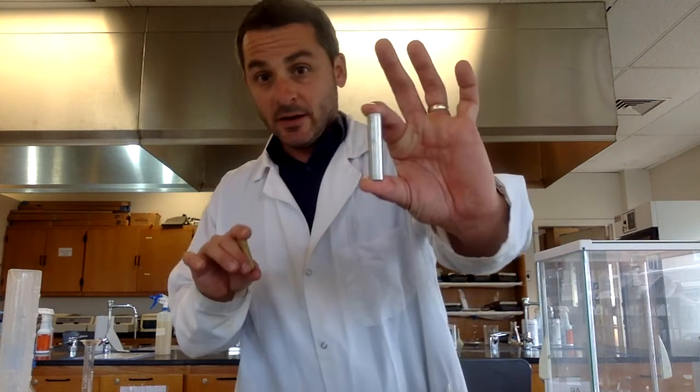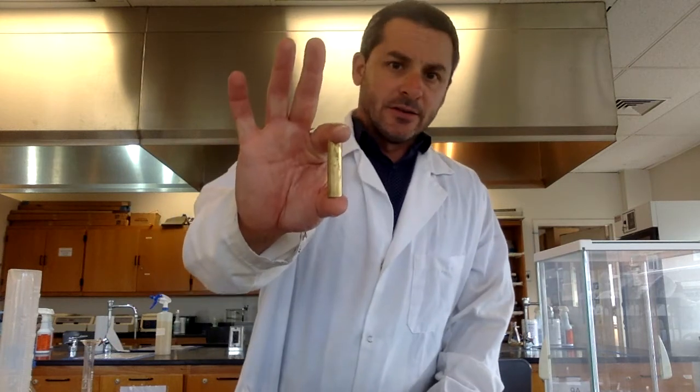First, we're going to find the density of a piece of metal. I have two different pieces of metal. One is this shiny silver color. The other one, we'll call it brass color because it's brass. One thing you would notice if you were holding these is they're roughly the same size, but this brass piece is much heavier than the aluminum. If they're the same size, they have roughly the same volume, but this brass piece is going to have a higher mass and a higher density, and I can feel that. Aluminum has a very low density for a metal, and this brass is much heavier.